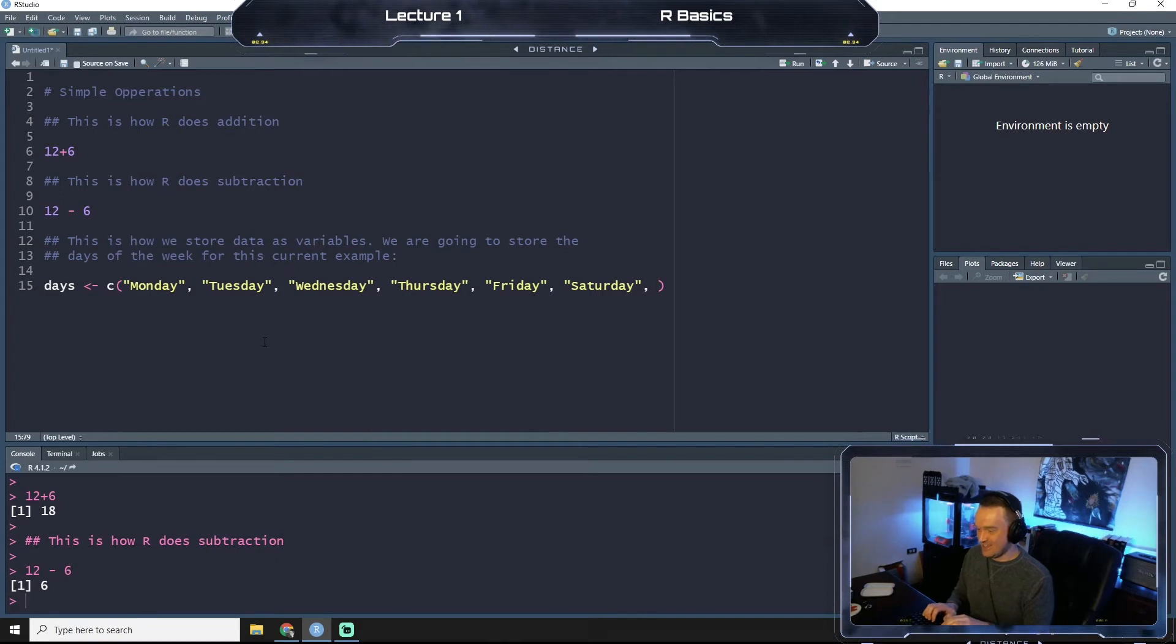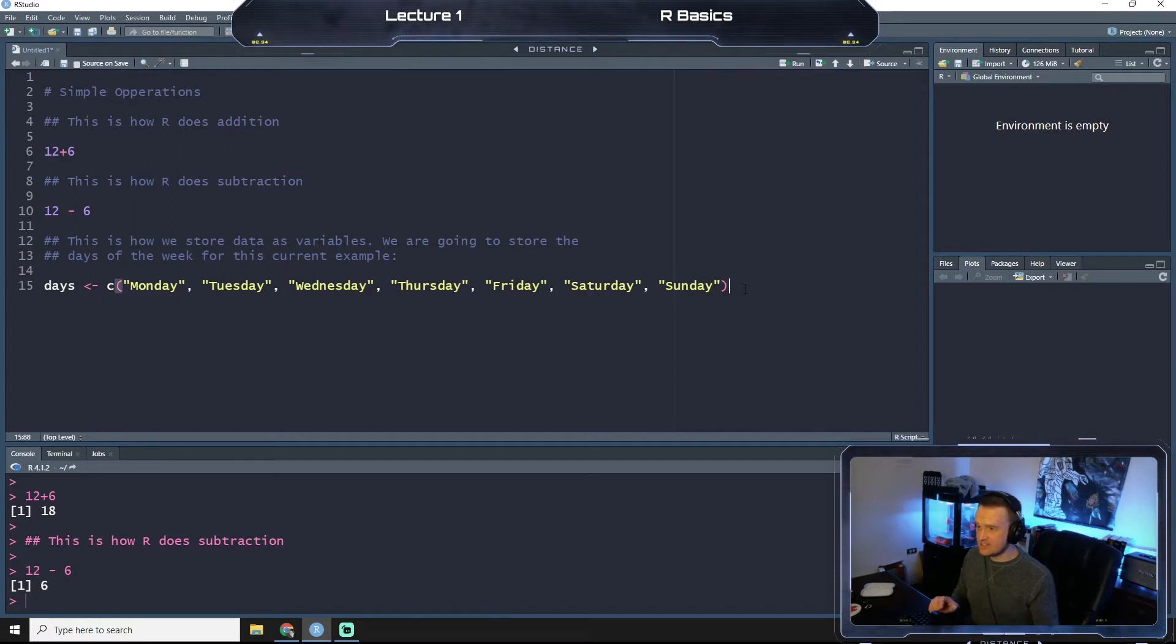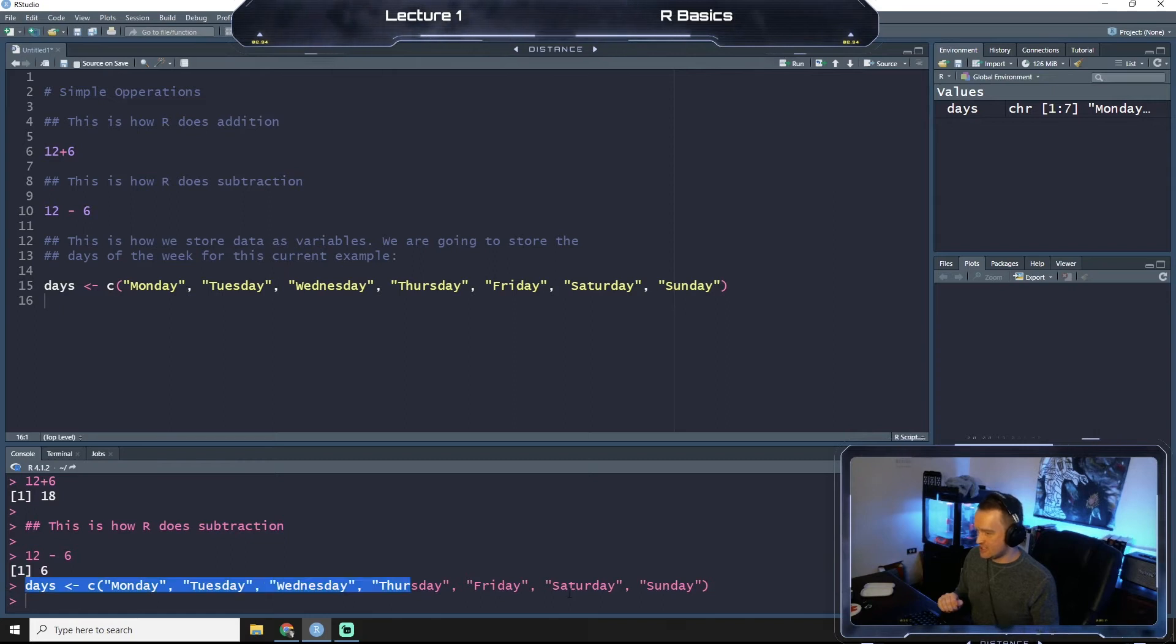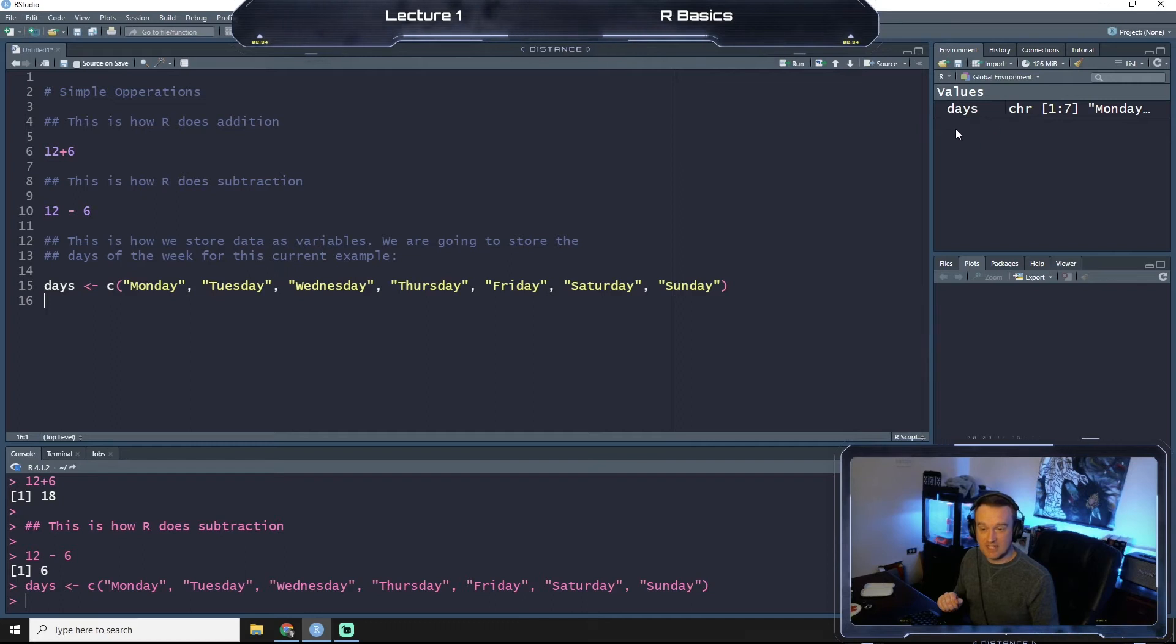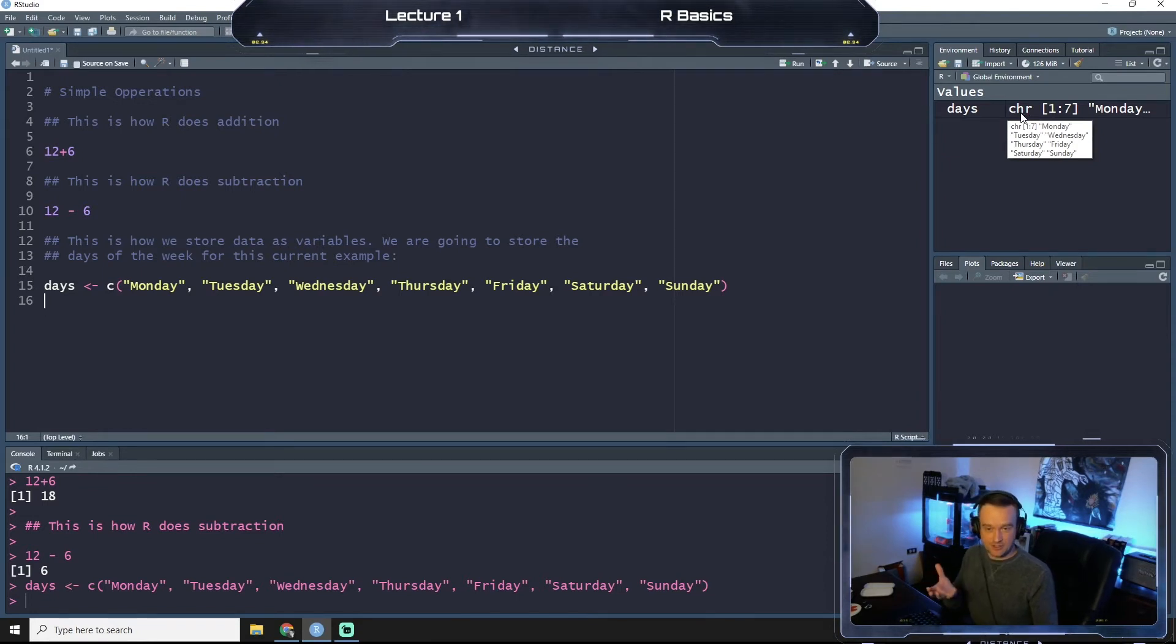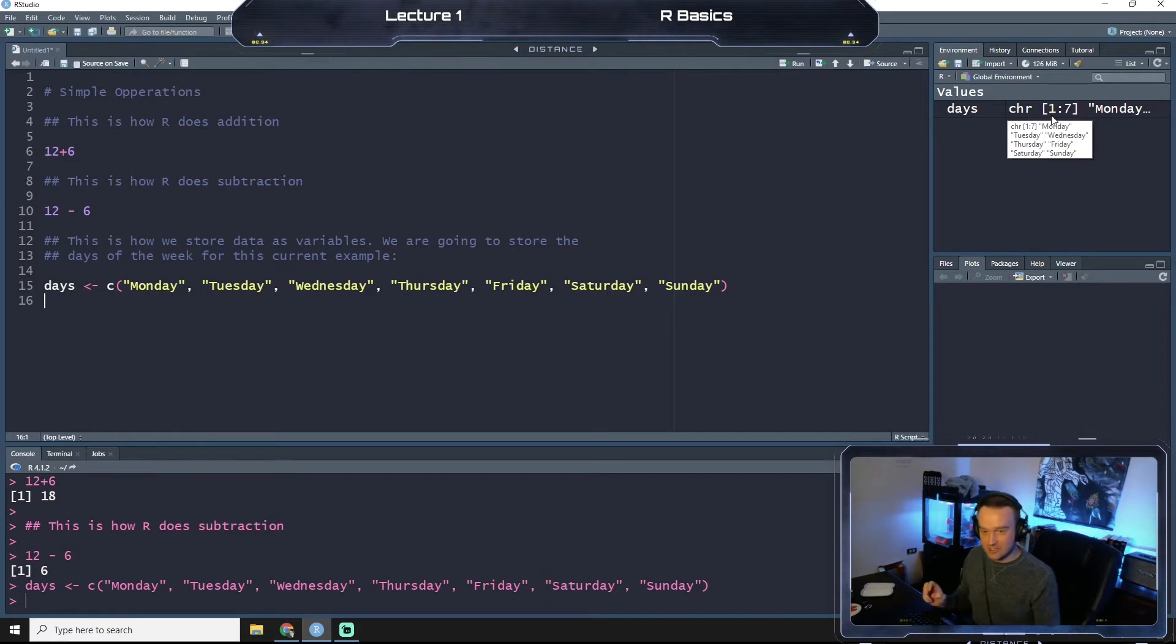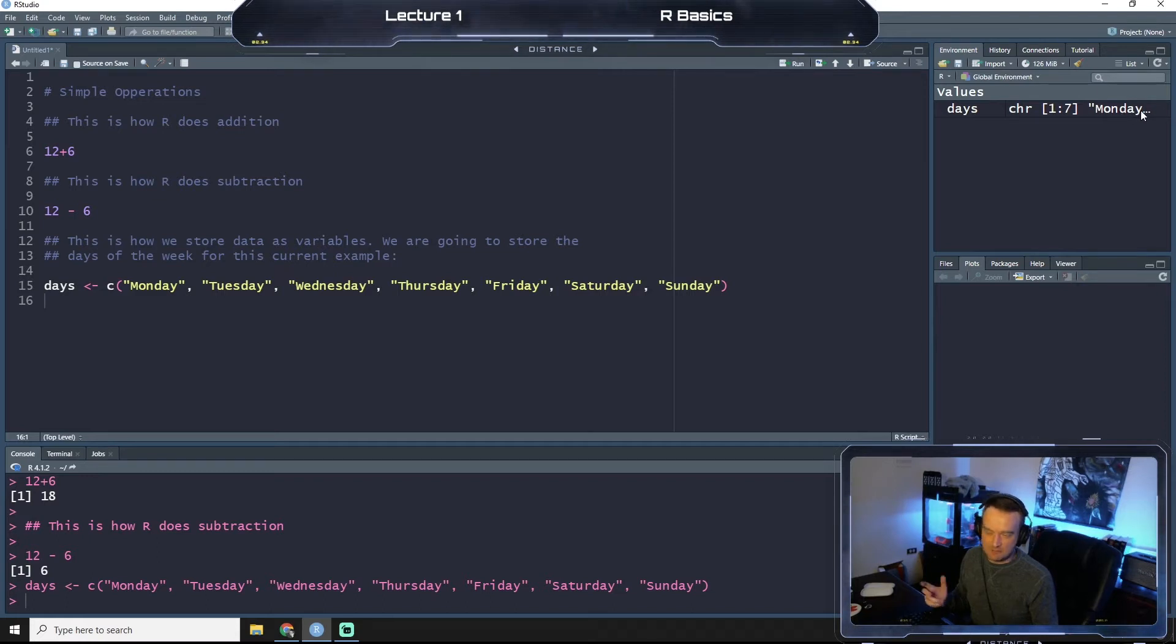Saturday and then Sunday. Okay, so now with this, if I were to run it, you see that down here it just says the code again. And up in the top right in our environment, you see that now days has been saved here and it says it's a collection of characters, so not numbers but words or characters. And there's seven entries, one through seven, and you can kind of see the beginning here that Monday is listed.